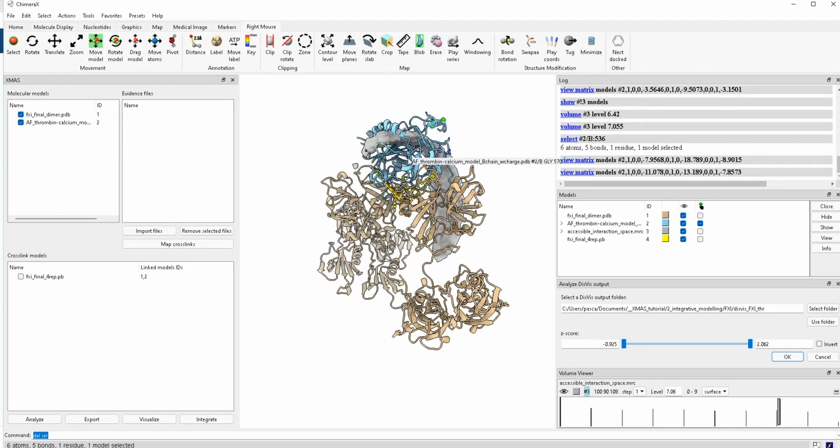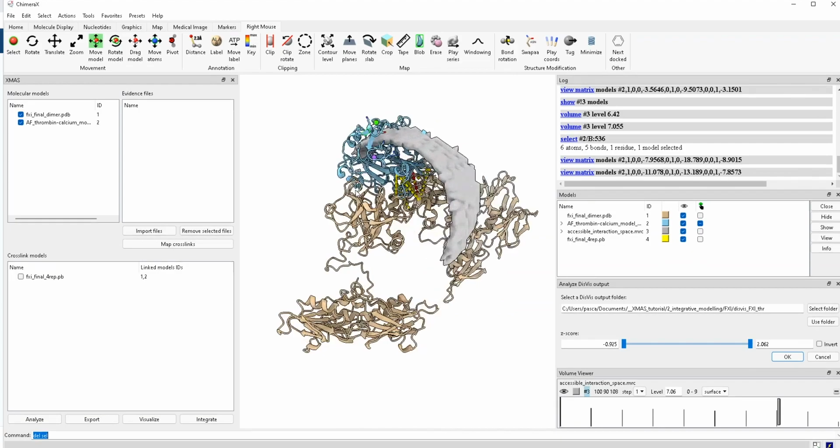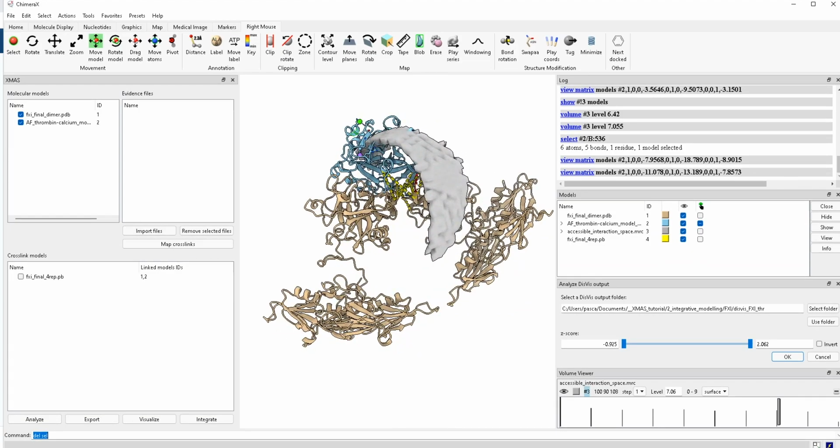So then we need to go through a round of molecular docking. This will take into account the properties of the amino acids and try to form a stable interaction in this interface between the two. So this is a pre-filter.